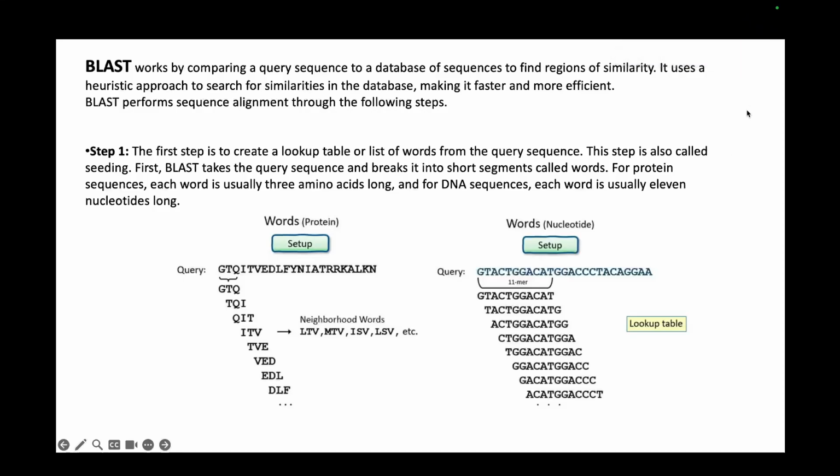Yeah, okay. So let's see how BLAST works. So BLAST, how does BLAST work? You give a sequence, a query sequence, in the query box inside BLAST, and you click on BLAST, and it tells you what are the most optimal reference genomes from where this particular sequence originated.